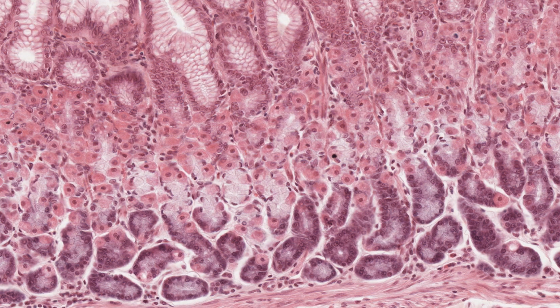Now here's an example where you can see both stains used together to distinguish typical cell components. Again, like I've mentioned before, you will come across this in most of your histological sections. This image is a section through the stomach. You can see a number of different staining features here.